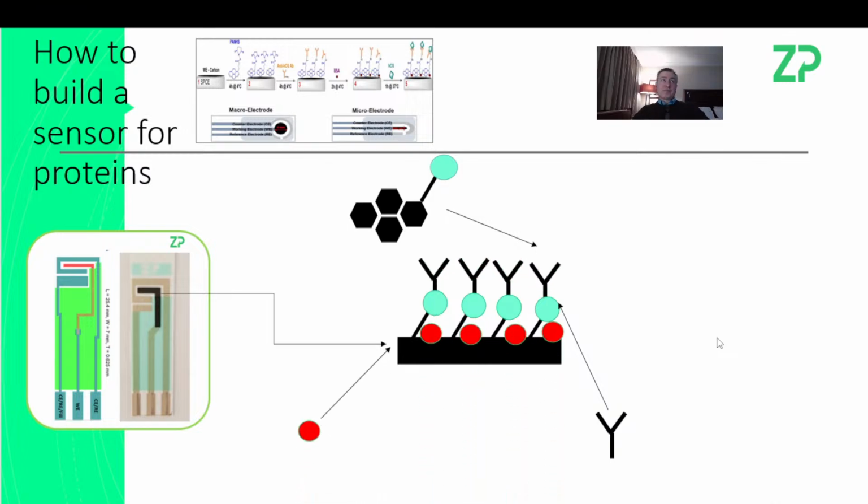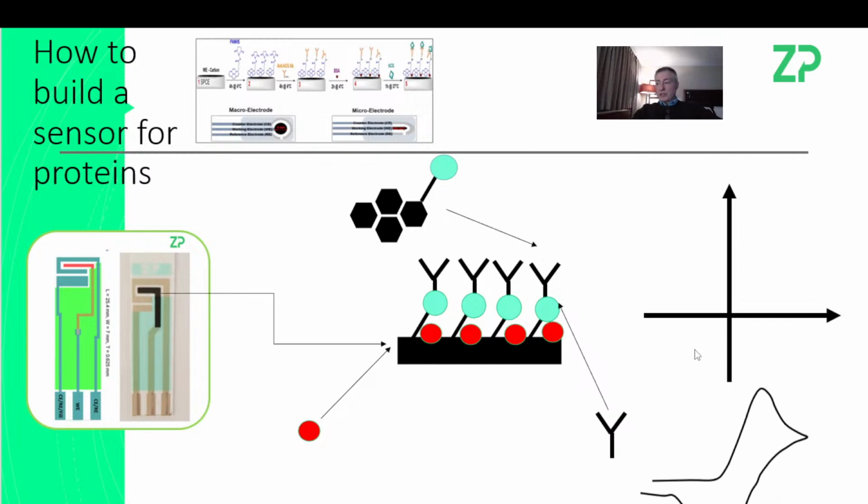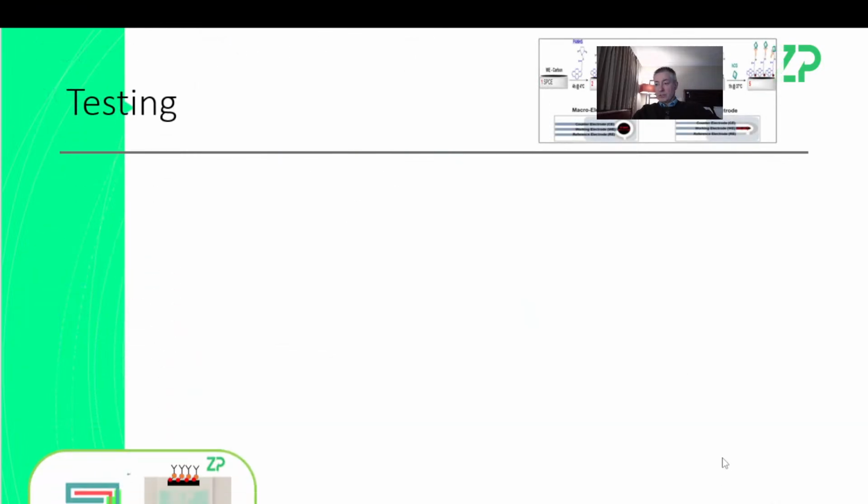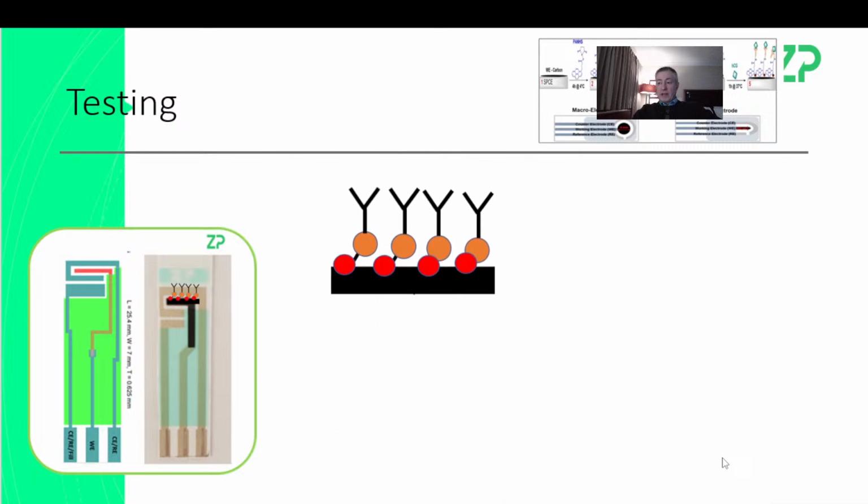with chitosan or BSA, bovine serum albumin. And as you do that kind of modification so that you can detect either proteins or antibodies or something like that, we often follow that modification process using cyclic voltammetry. It's probably worth saying that we go into this in quite a lot of detail in these workshops that we do, and we do develop sensors for the detection of protein.